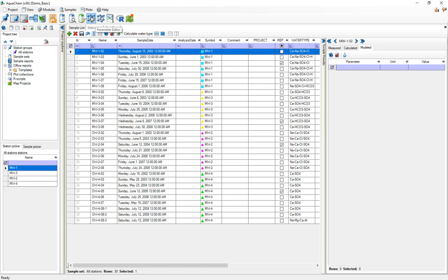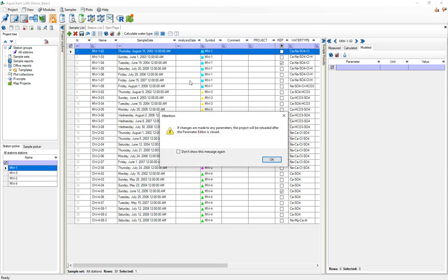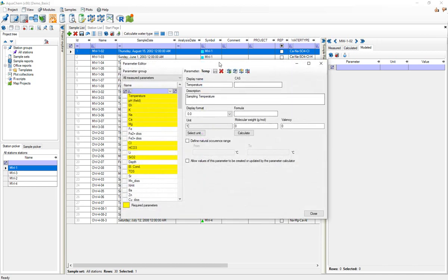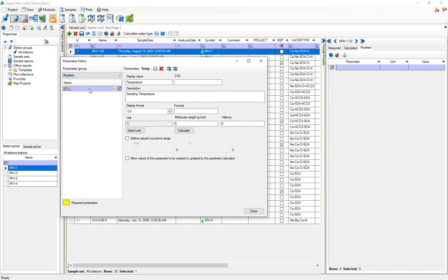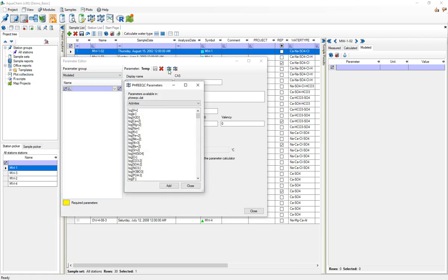This button right here. I'll get this warning and I'll go to the parameter group modeled. So if you're on the parameter group modeled, and only if you're on the parameter group modeled, and you press this button here you can import parameters from your thermodynamic database.